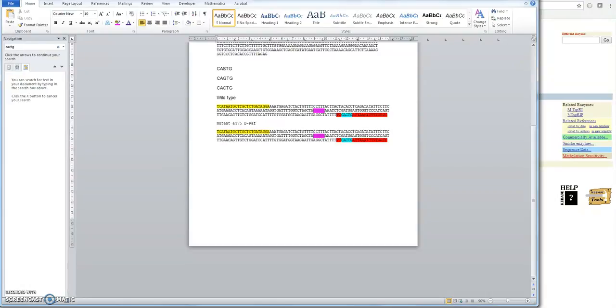Now the mutation is known as V600E. Now that's useful information. That means that it's a valine at position 600 of the BRAF gene, which is mutated to an E, which is a glutamic acid, I think. So that's a mutation. What we need to do is just verify for ourselves that this is the correct sequence that covers amino acid 600, and we think that amino acid 600 should be around about there.